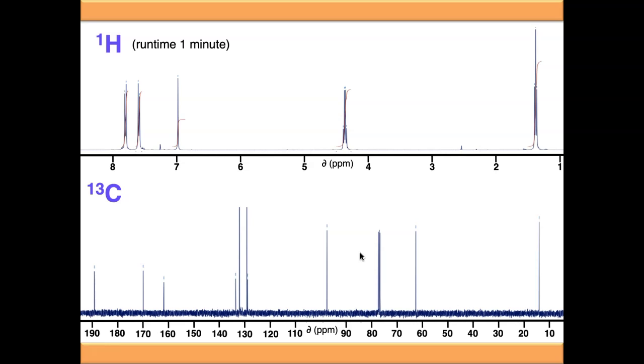Another practical difference is that proton NMRs typically take around one minute to run, whereas carbon-13 NMRs can take around 15 to 30 minutes to run. We'll come across some of the reasons why in this video.